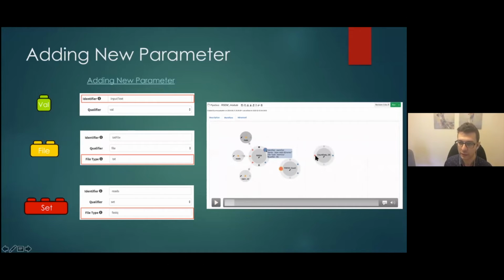You can see that these dots are kind of smaller, which means that you cannot connect this node with these nodes or this node, since their file type is different. Only this file type is the same, so you can easily connect those.